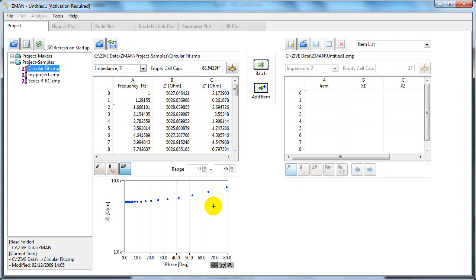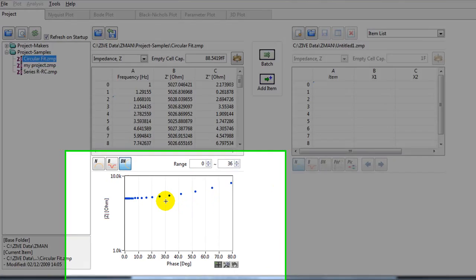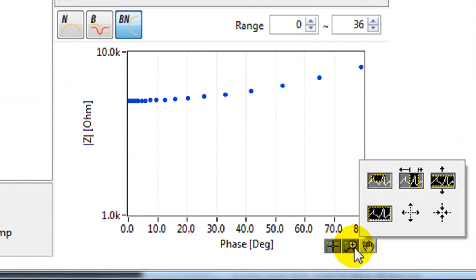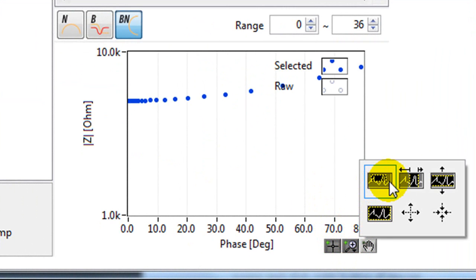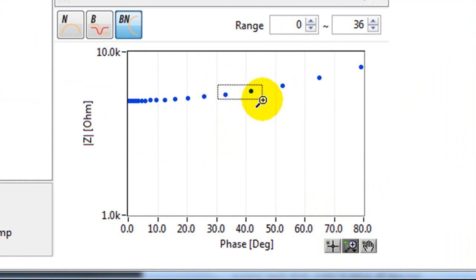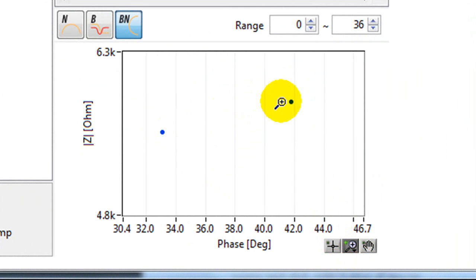There are also various options for the plot. For example, down here you can select to zoom in to some data. You can click on here and draw a rectangle around. You can zoom in to data.